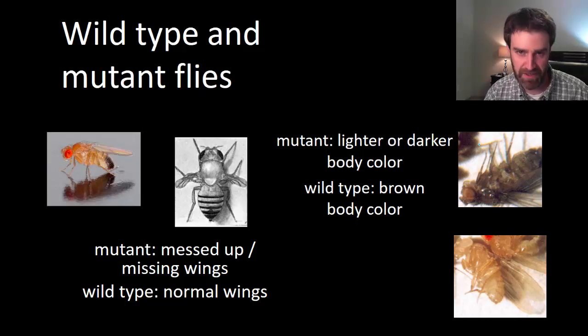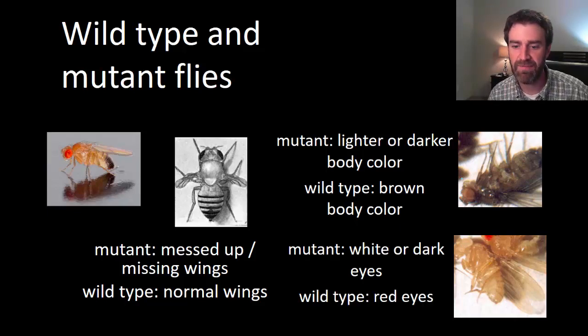And the final variation we might play with is their eye color. So in some cases they might have white eyes or very, very dark color eyes, black eyes essentially, versus the wild type eye color, which is red.